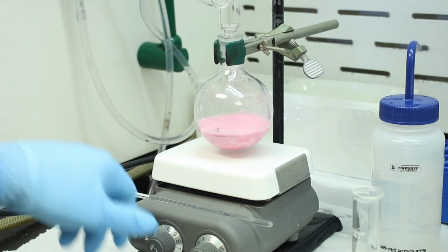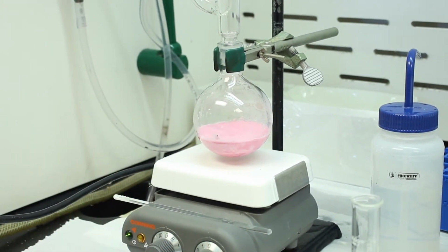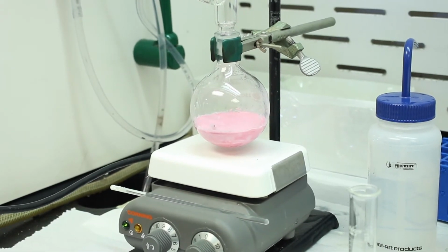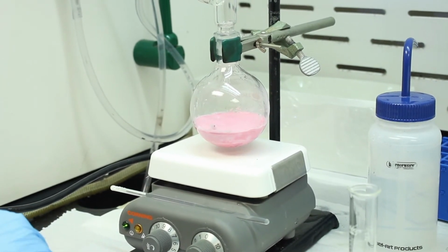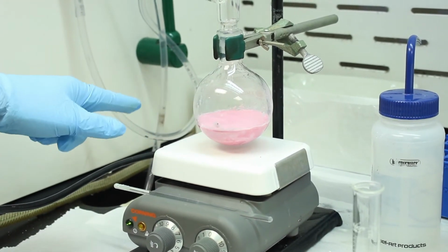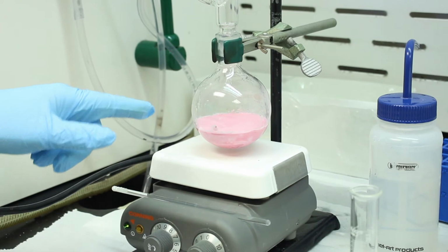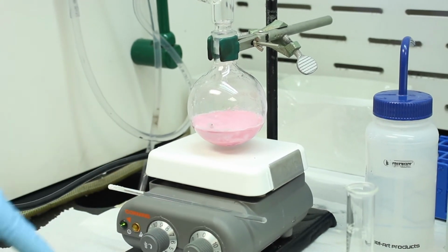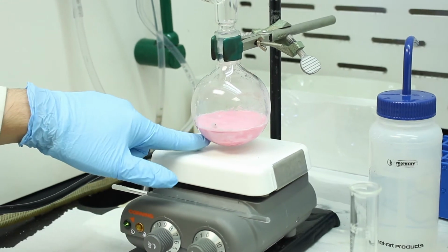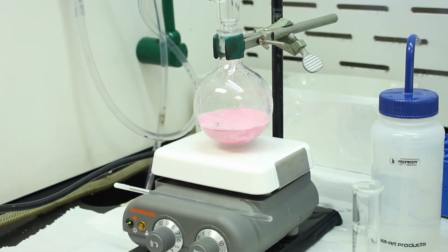So at this point, our Grignard reagent has been pretty much fully consumed, and it's reacted with the benzophenone to form the triphenyl methoxide adduct. The adduct consists of the deprotonated triphenyl methanol and the magnesium bromide cation, and that is very ionic, so it's not soluble in diethyl ether, which is why it's precipitated out.